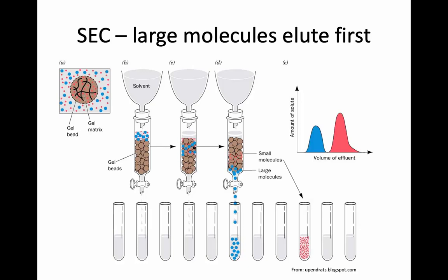So the idea in SEC is that we pass a solvent through your gel beads, and we collect, as you'll do today in lab, constant volumes and record their time, right?